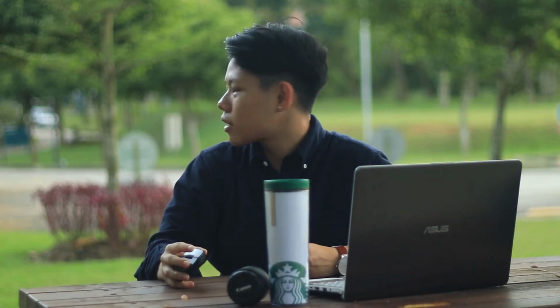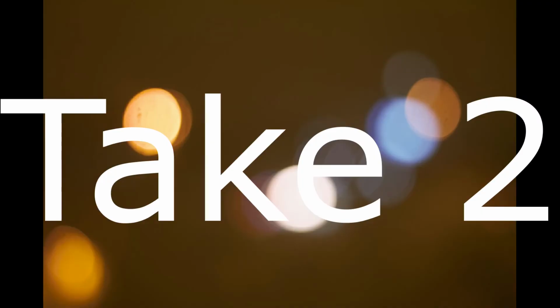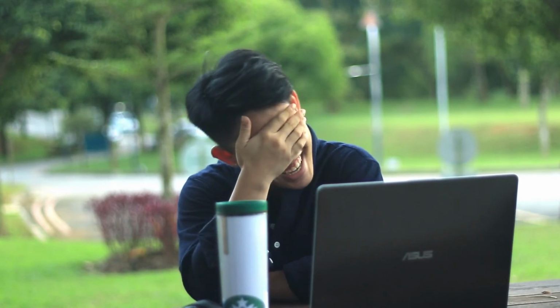Okay. An appropriate blank is a... oh my god. Prerequisite. Prerequisite, that's the thing. Okay. An appropriate blank is a prerequisite. What is it again? Prerequisite. This is how messed up English is.